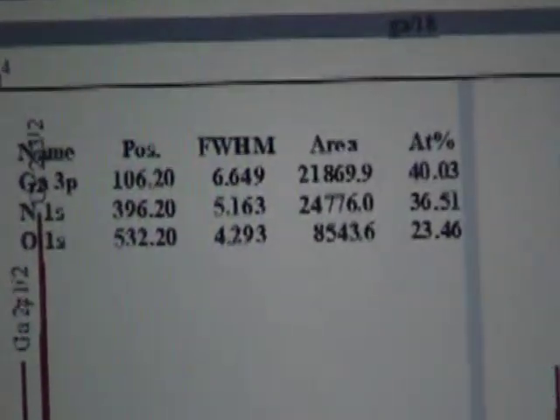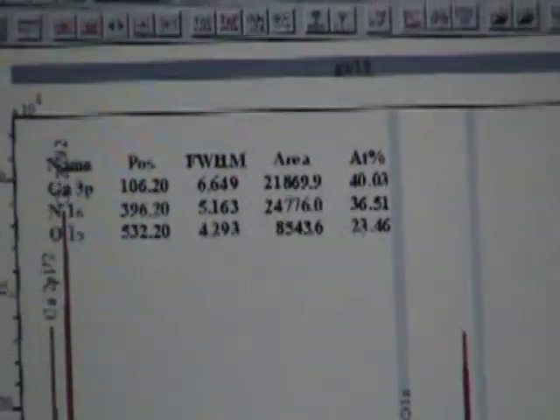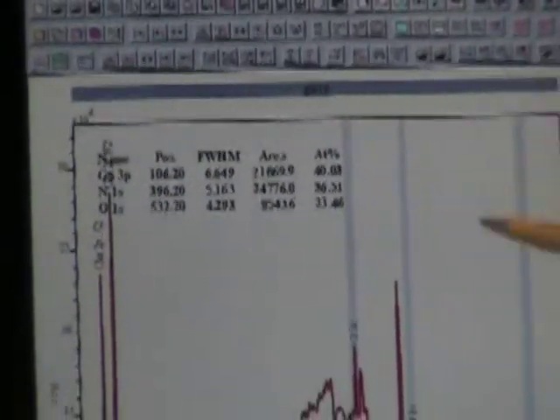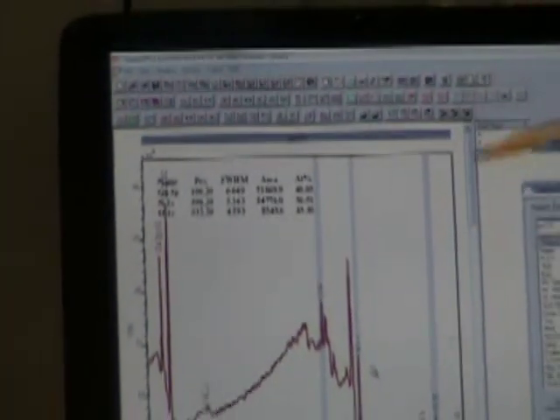Again, the two numbers should be equal. Although, of course, since XPS is so surface sensitive, again, we expect that some of the galliums may be bonded to oxygen. So it's not surprising that the nitrogen is a little bit low.